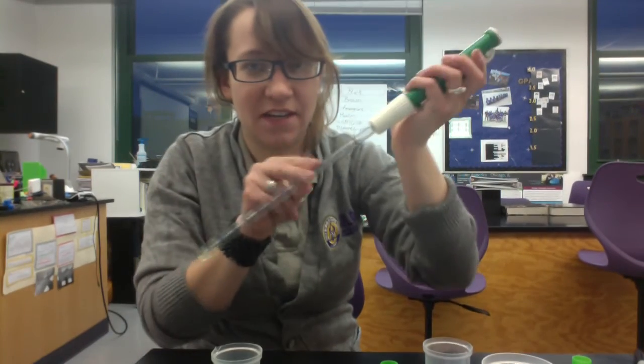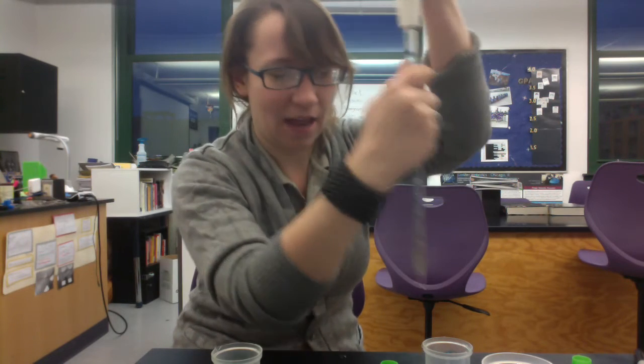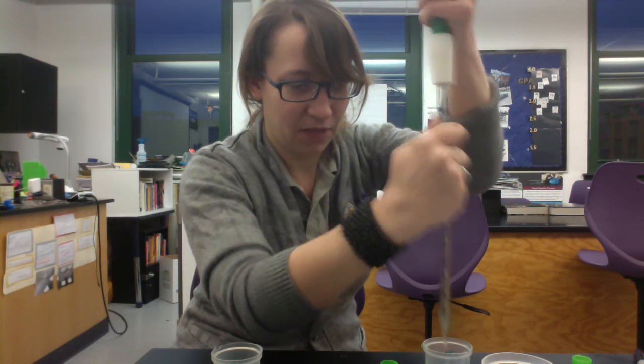Once you're done with that, someone in your group is going to need to go and rinse out the pipette — not the pipetter, but the pipette — to get all the residual alginate and algae mixture out. You want to get all that out.